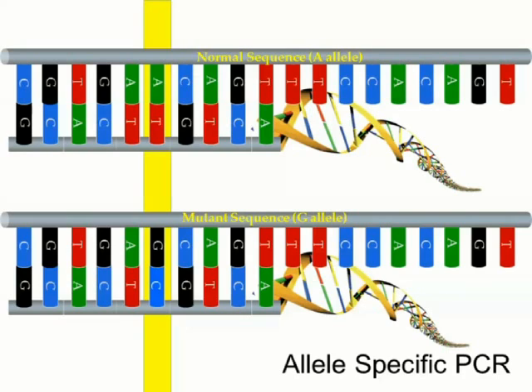There are detection methods that don't require actual detection of the mutation. Those screening techniques like SSCP that we used to do all the time. Why did we used to do that instead of sequencing? Because sequencing was expensive and not everybody had a sequencer. And you didn't want to put every sample into the sequencer when it took hours and hours and you only had a limited number of samples.